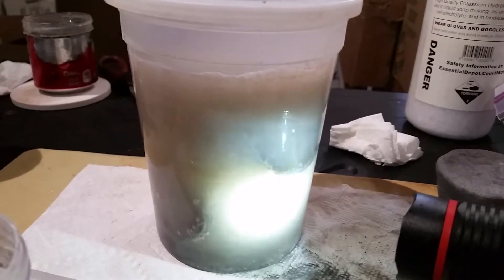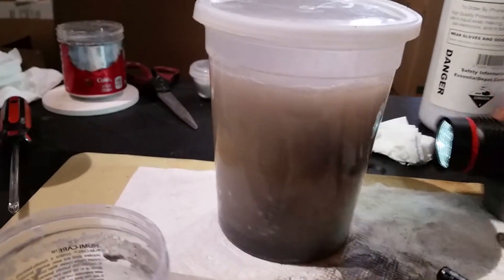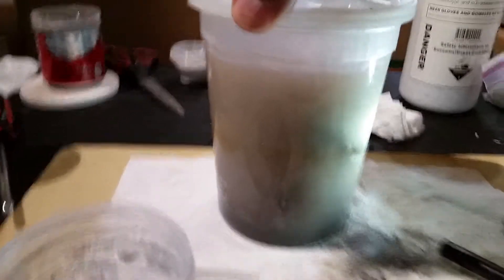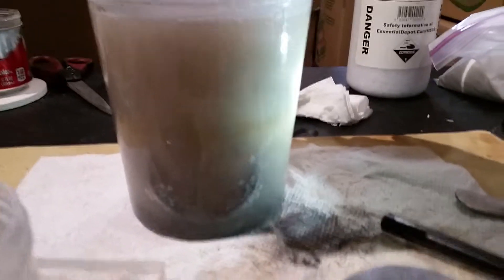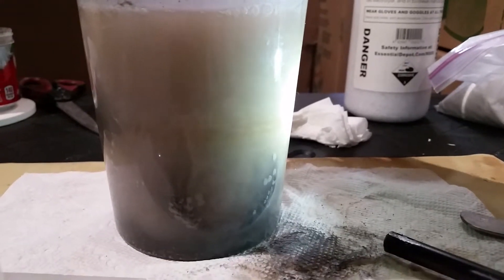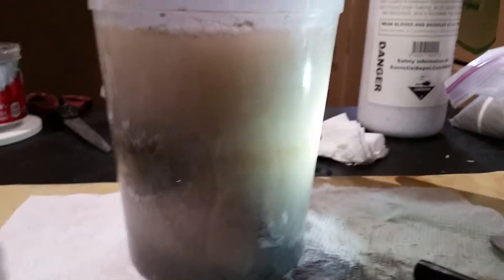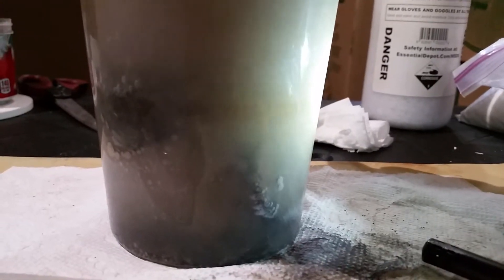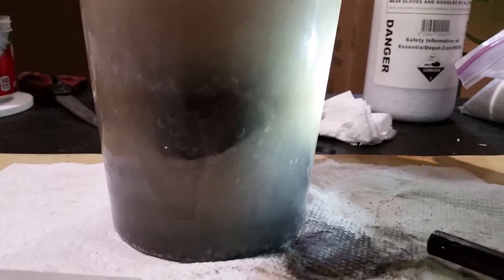That's the reaction of the ingots inside. I'm going to turn this a little bit for you — you can see all the bubbles that are forming inside, creating the hydrogen.